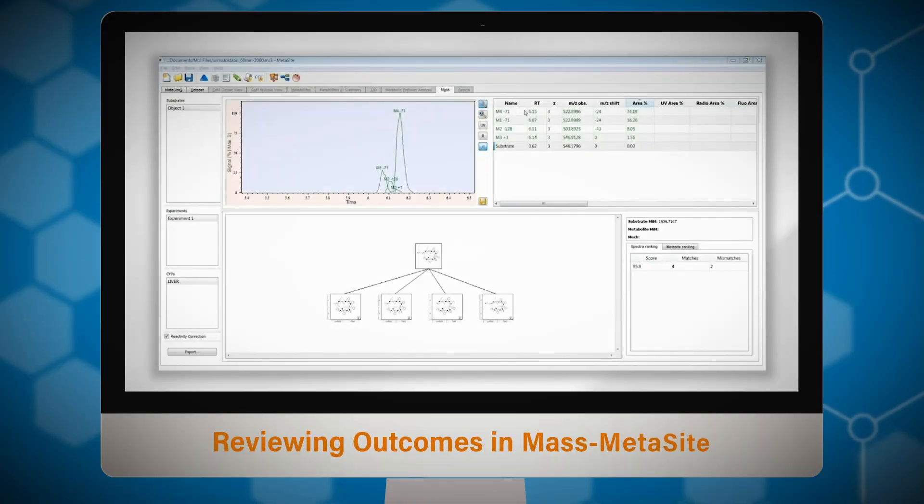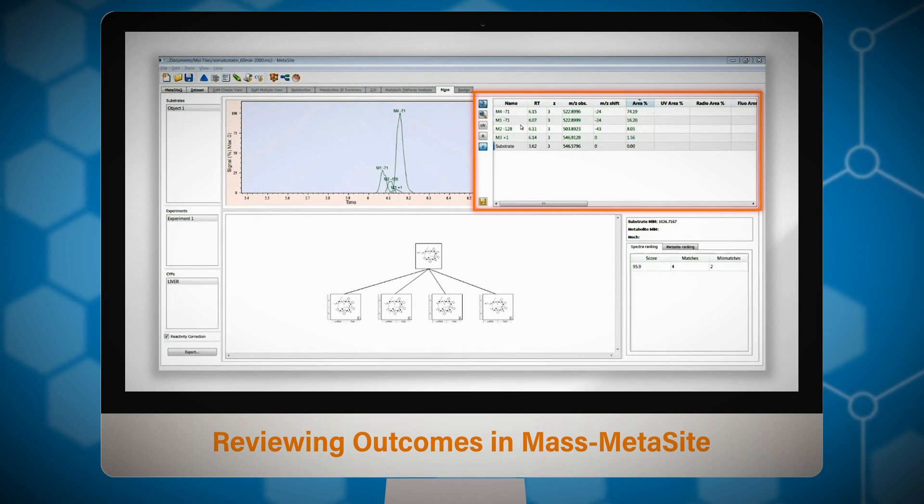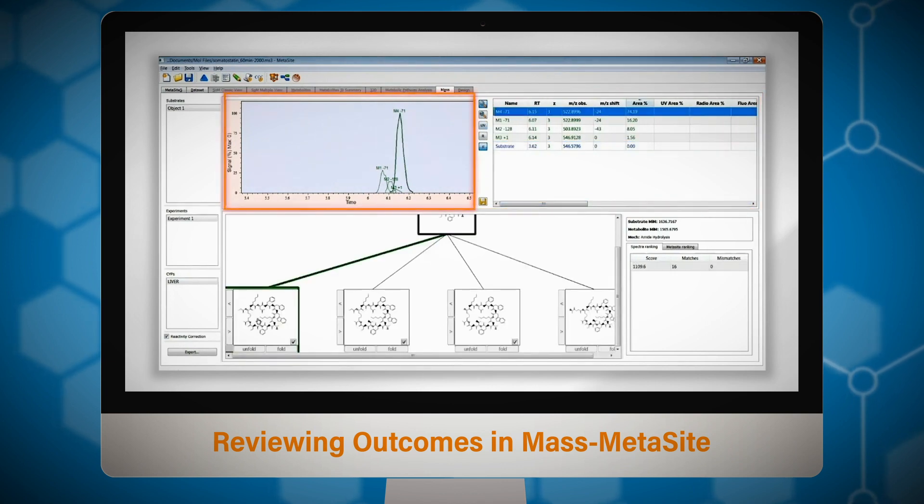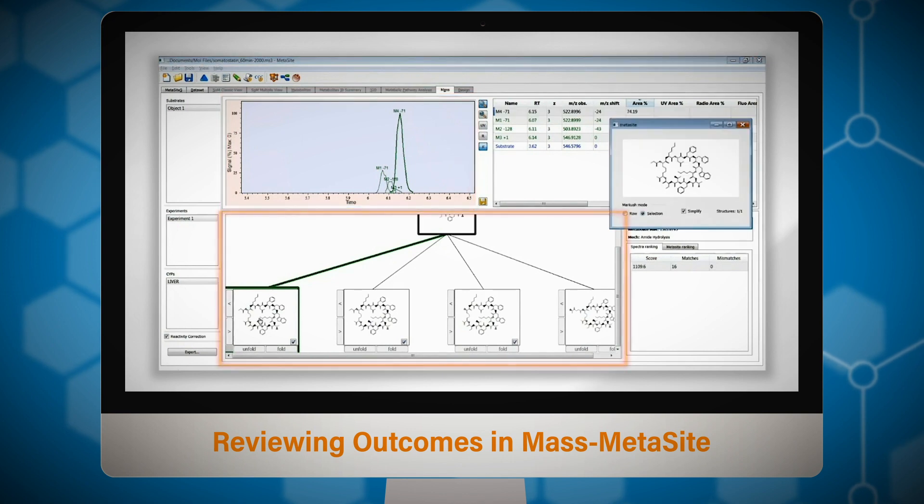Once data processing is complete outcomes can be reviewed. At top right we have the component table containing the observed mass-to-charge ratios, retention times and collision cross sections for each potential metabolite. We also have an annotated chromatogram and a metabolite scheme in which the most likely explanation for each observed component is presented.